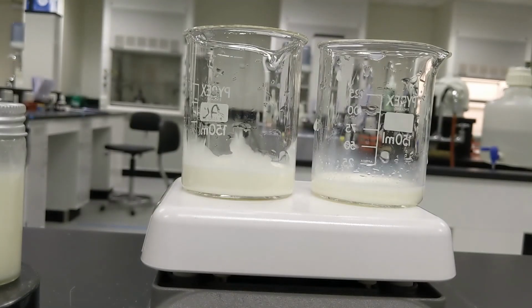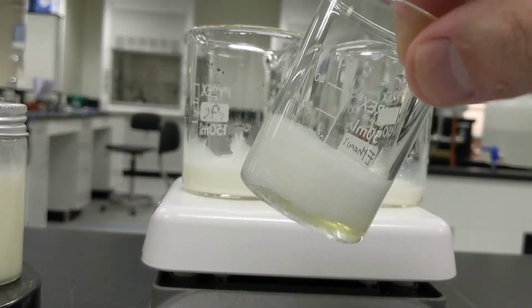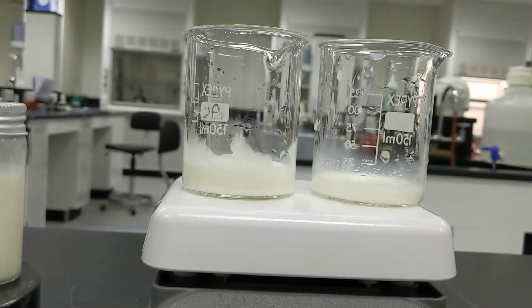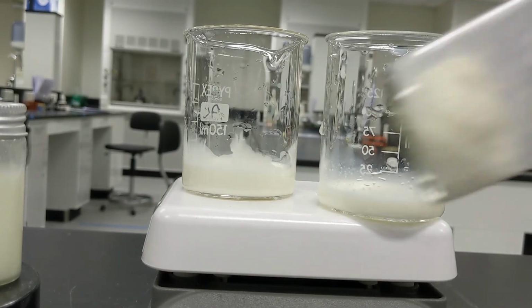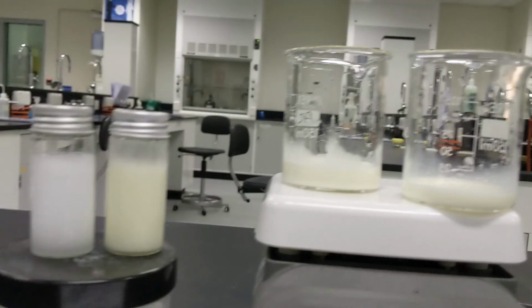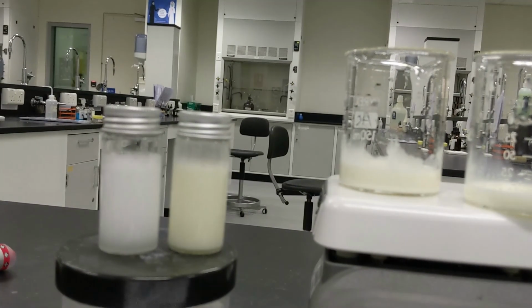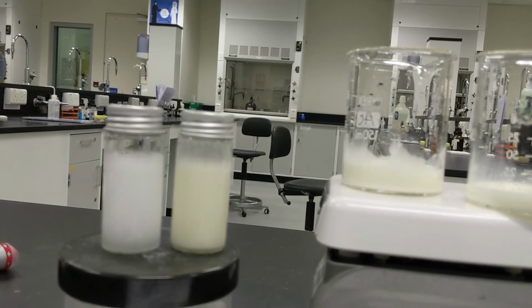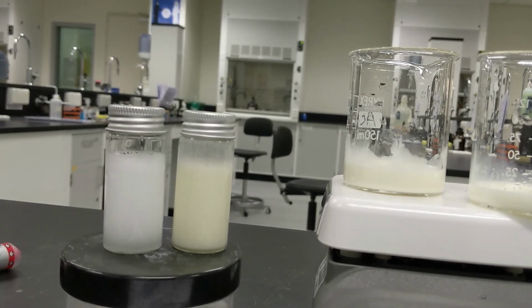So that's it for today. That was maybe a bit longer than I thought, but we successfully made one type of colloid. This is a gas in a liquid medium. We've broken a colloid. We've emulsified two liquids using something called a surfactant, which I'll let you guys read your notes about. And we also looked at the Tyndall effect.